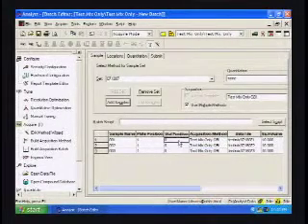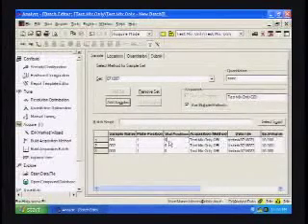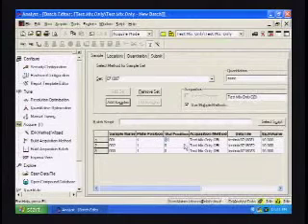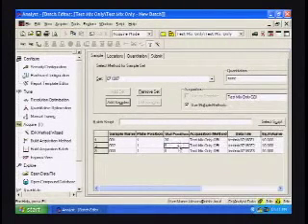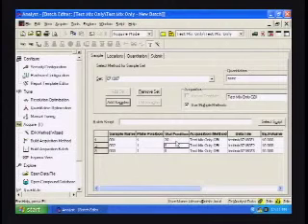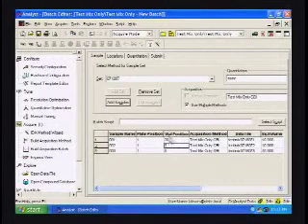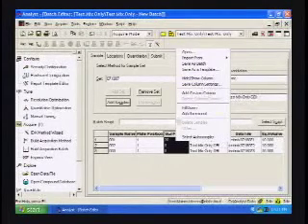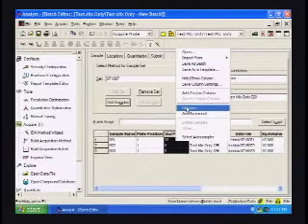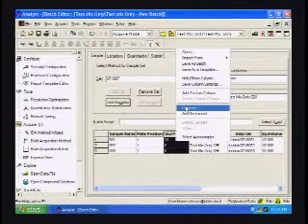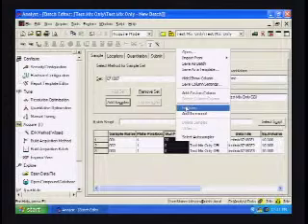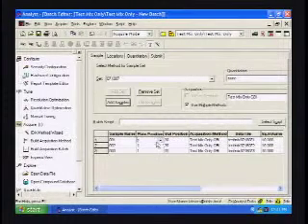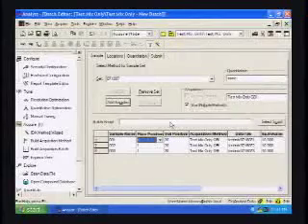So the only thing left to do here is designate the vial position. Well currently our test mixture solution is in position 20 in the auto sampler. If you had quite a few samples, there's an easier way of filling in these boxes. If we highlight all of this and then right click, we can either fill down or auto increment. But since these test mixture solutions are all in the same vial, we'll use the fill down feature.